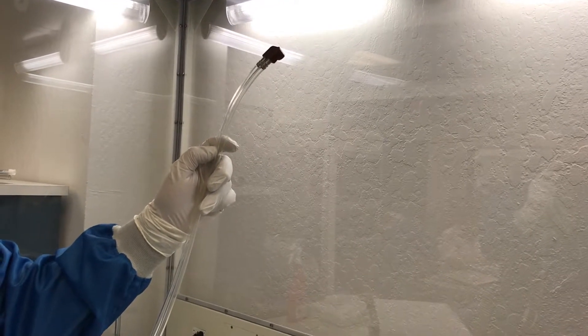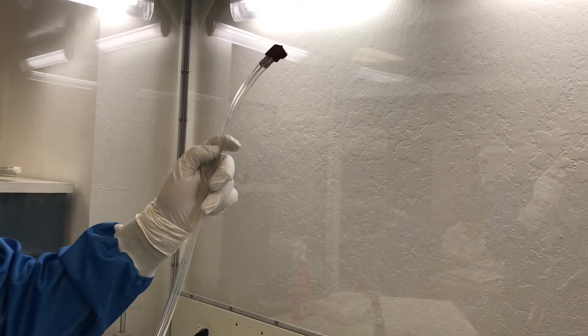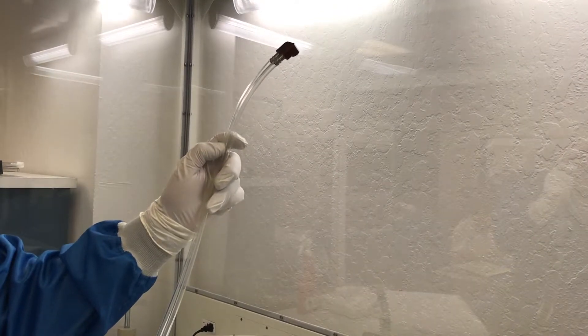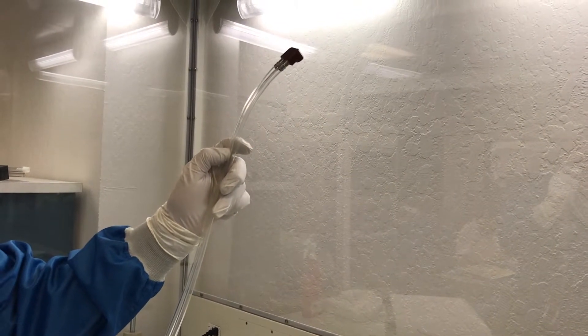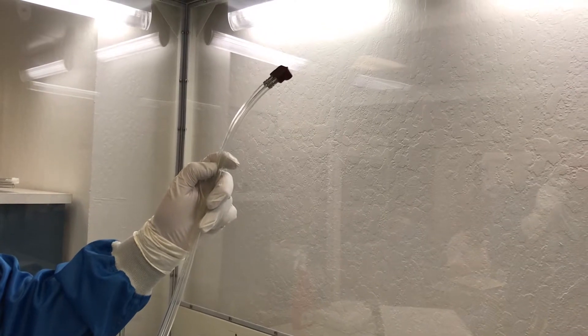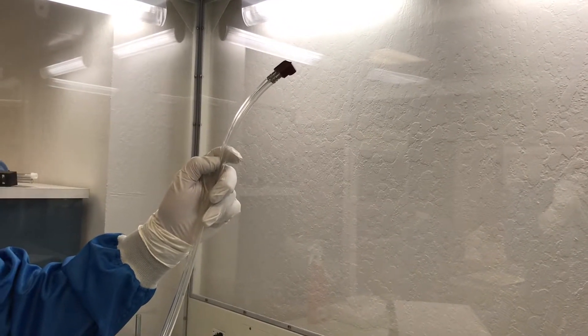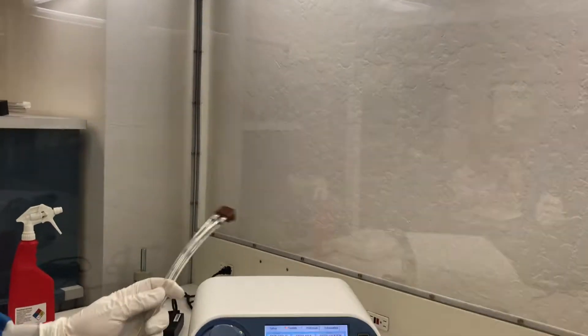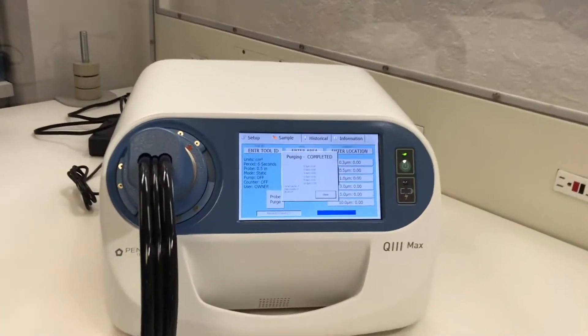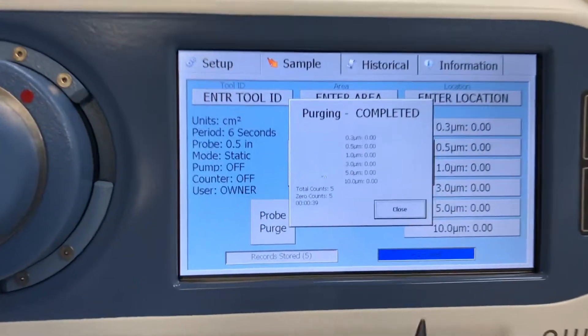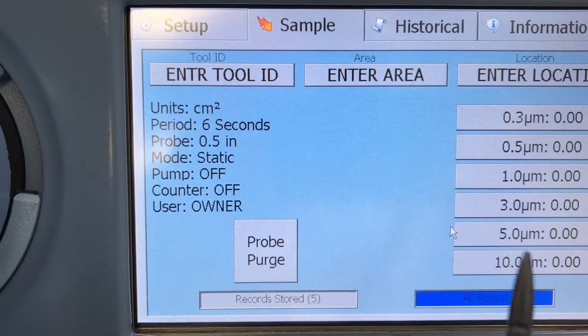The purge process should take 40 seconds to a minute if the environment is clean such as ISO class 5 or better. Notice how the screen shows purging complete. This means that the system is ready to begin testing.